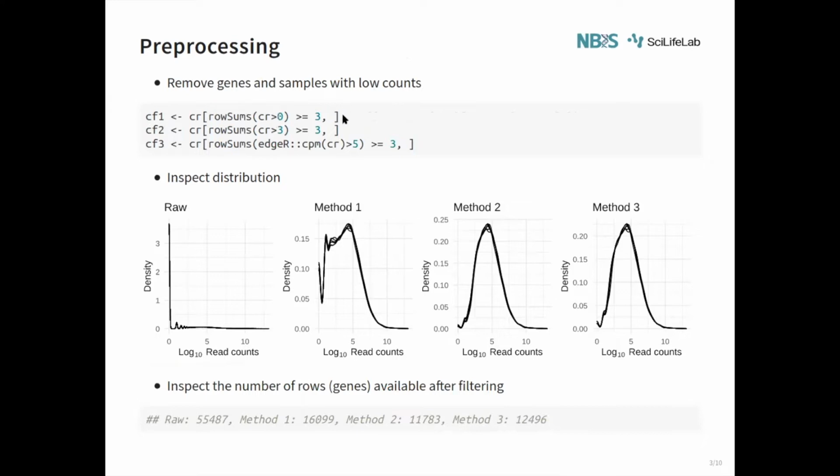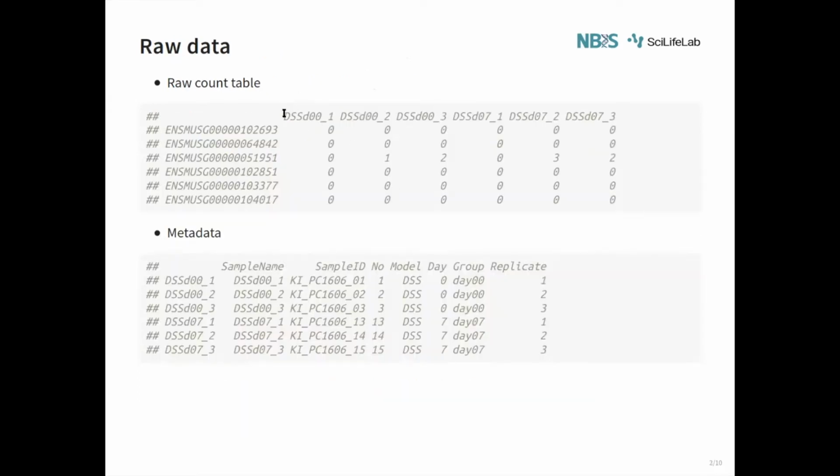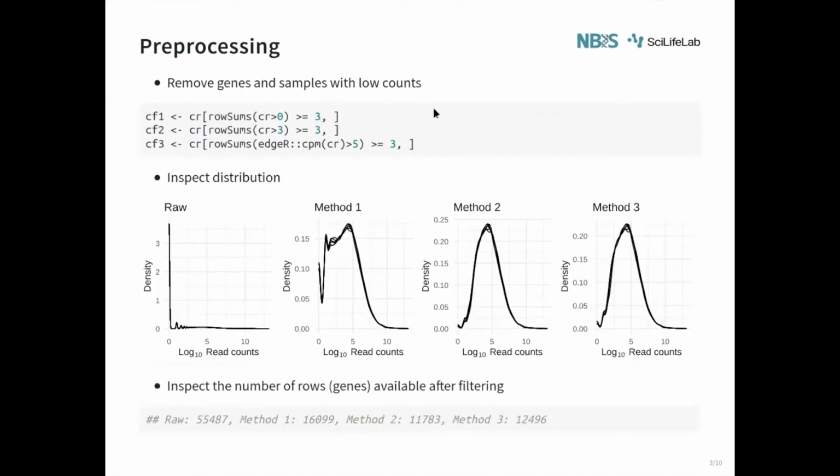And then the next step is basically this whole thing. And that is, again, a conditional statement where we are asking, so the total sum, is it greater than or equal to 3? And why 3 is just because we have 6 samples, and we know that 3 of them belong to group A and 3 of them belong to group B. But that depends on your experimental setup and your sample and so on. Whether this should be 0 or whether this should be 3 or some different value, again, depends on your particular data set.